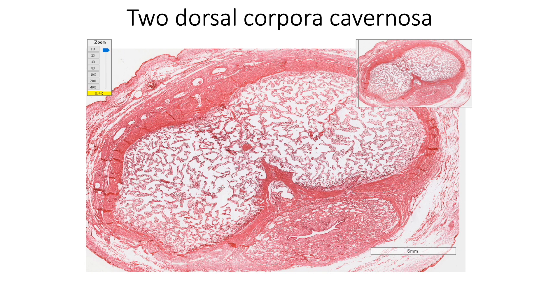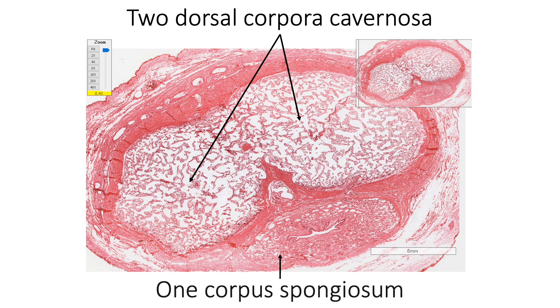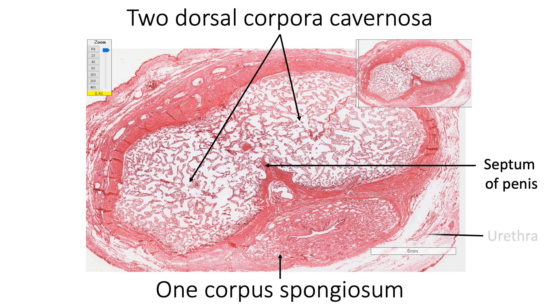Here we are seeing a section of the penis showing a pair of corpora cavernosa dorsally and corpus spongiosum ventrally. The two corpora cavernosa are separated by the septum of penis proximally, but the septum is incomplete in the distal part of the penis as we can see here. We are also seeing the transverse slit-like lumen of the urethra in the corpus spongiosum.